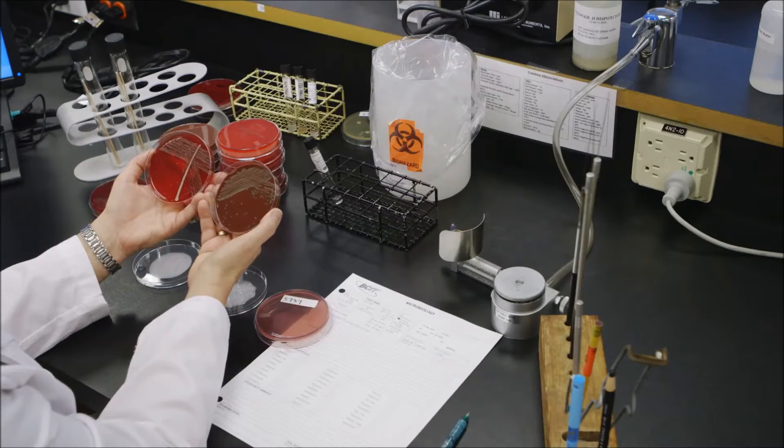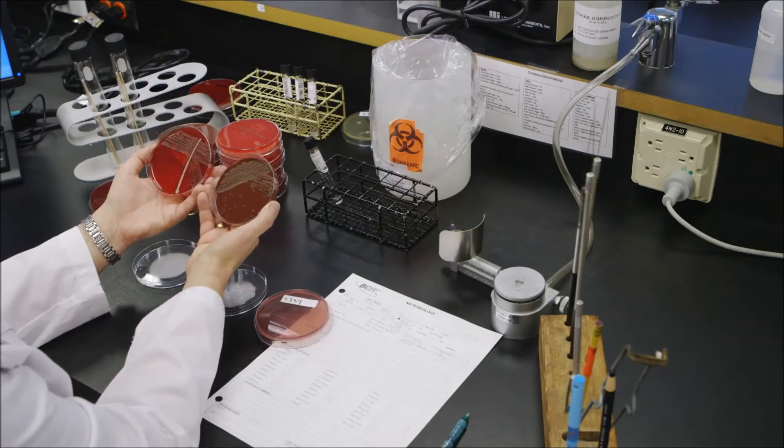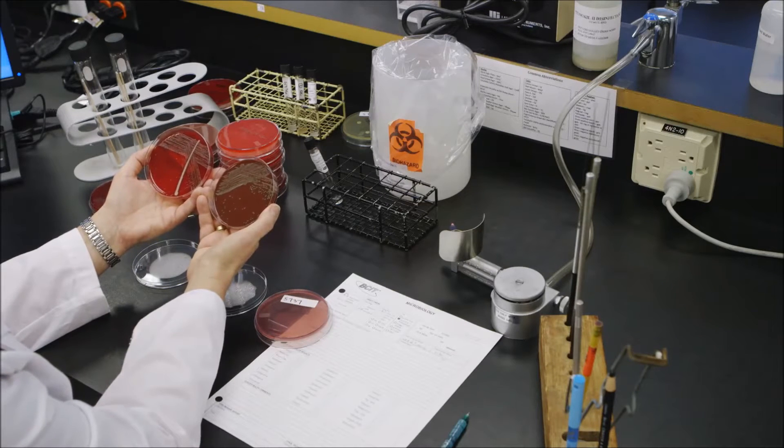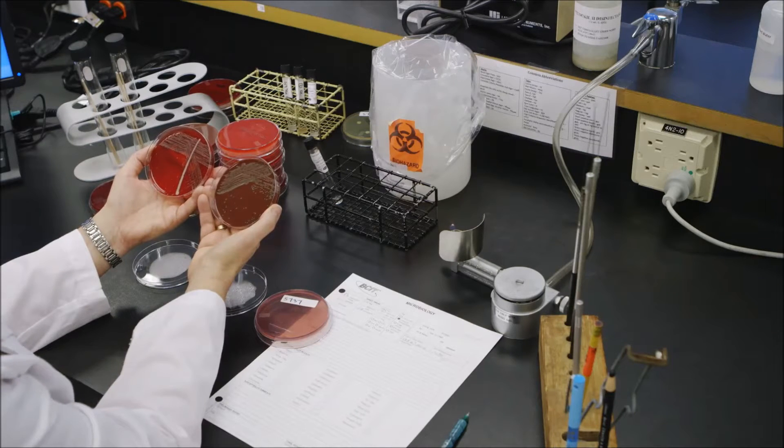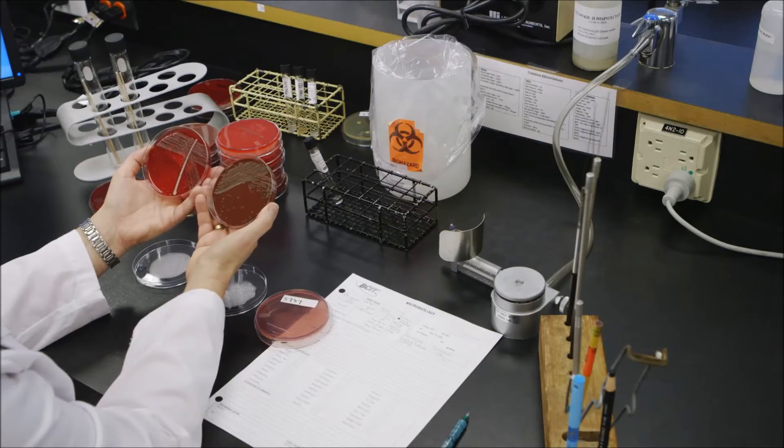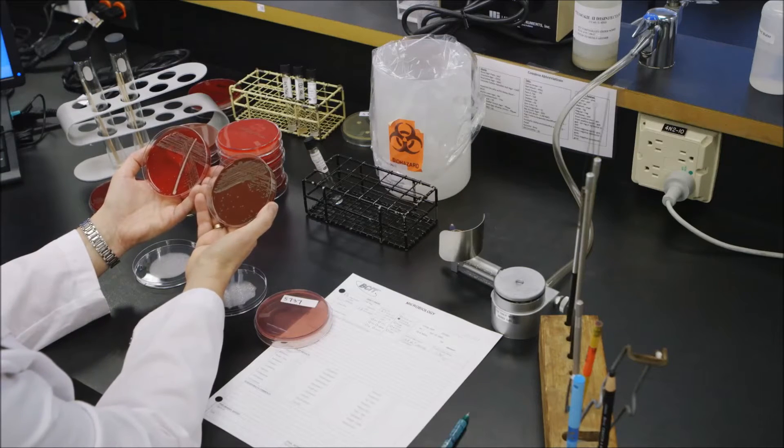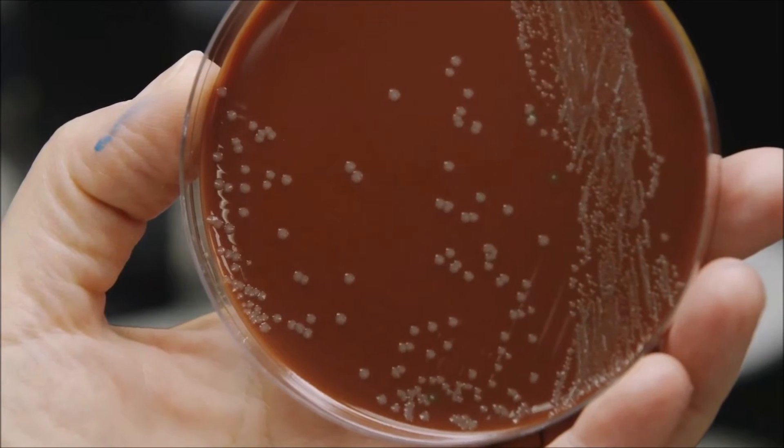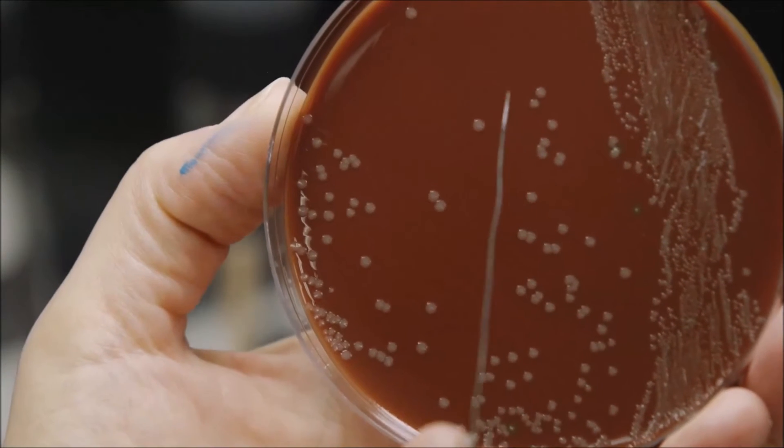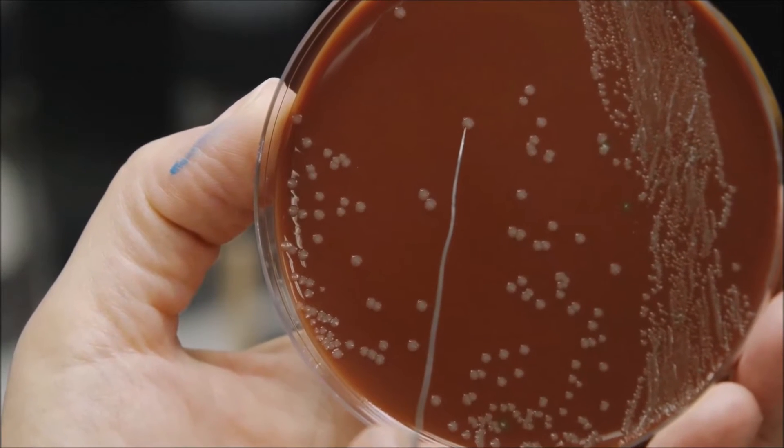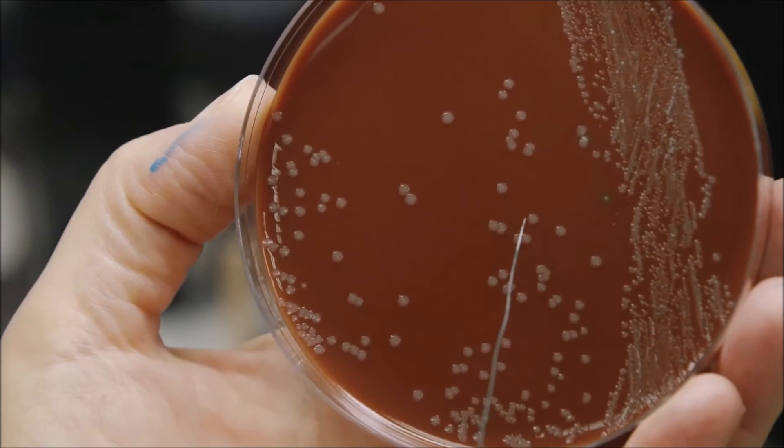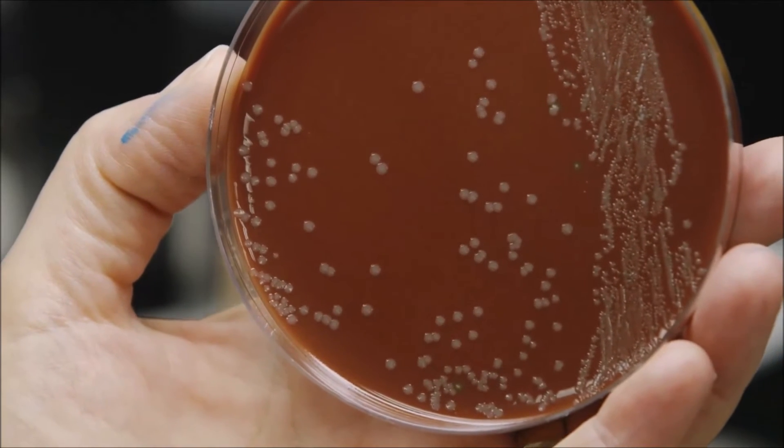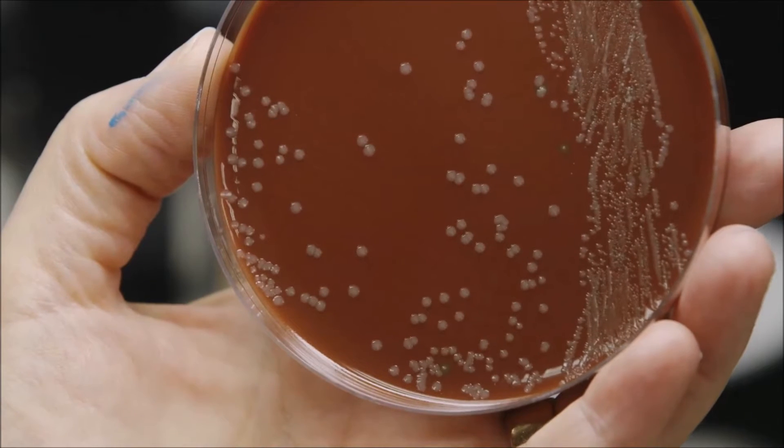So side by side you should be able to determine if there is a colony growing in abundance on the chocolate plate that you don't see in similar size on the blood plate. When I look at these two plates I see this colony right here. It's a medium-sized gray or tan colony that's growing in at least a plus three amount of growth.